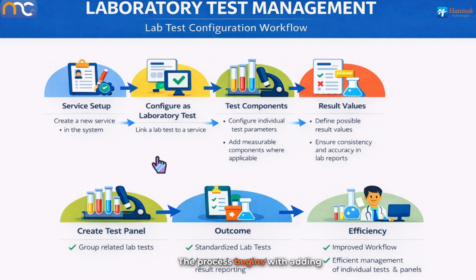The process begins with adding a new service, where the appropriate pricing is defined. Once the service has been created, and it is intended to function as a lab test, it must then be configured accordingly as a laboratory test. This configuration ensures that it appears correctly within the system as a lab test.